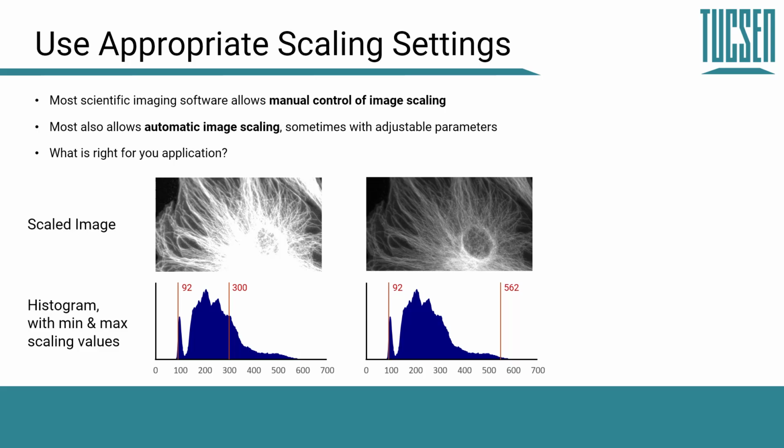And that can be really quite distracting and not very helpful for judging the intensities of signals. So what's typically done by camera software is some degree of ignoring a percentage of the brightest and darkest pixels. For example, you ignore the darkest 0.1% and the brightest 0.1% in choosing what these image scaling values, upper and lower bounds, should be. That way we have much more stable images in terms of their image scaling settings, and this can also enhance the contrast that we see things with.